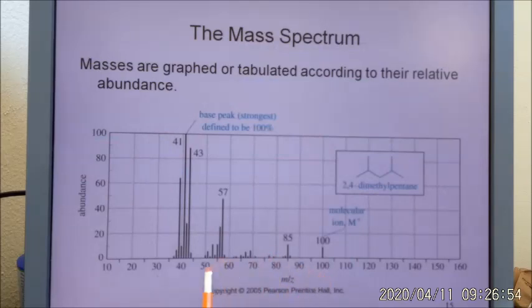So what's interesting about your mass spectrum is this. Because we have separation based on mass, you can detect ions as well. Okay? So basically, if this is my molecular ion, or isotopes as well, this is my molecular ion. The difference between this and this is 15, which means I lost a carbon and 3 hydrogens, a methyl radical, to form this one. So it's like you get cleavage here, it'll form a secondary carbocation.